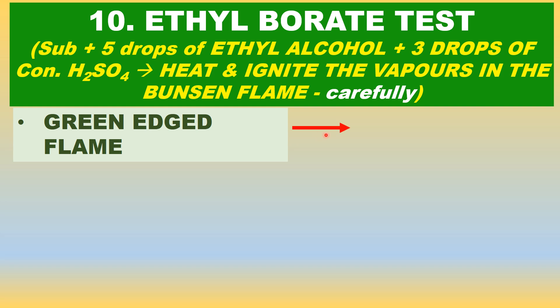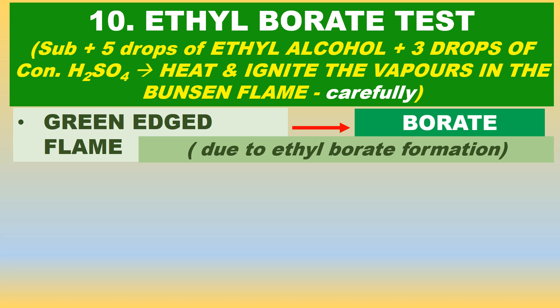The vapors will be ignited and will form a green-edged flame. That indicates the presence of borate salt, and it is due to ethyl borate. Ethyl borate gives a green-edged flame.